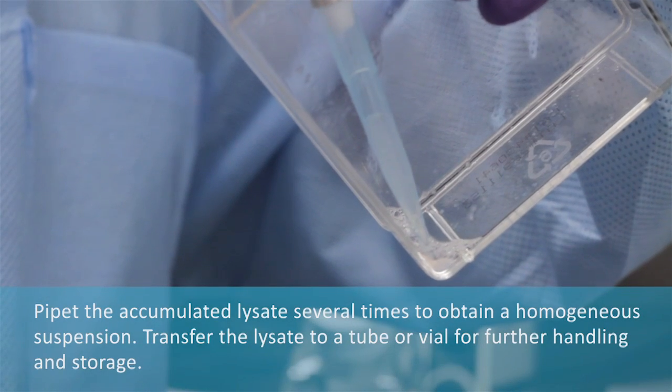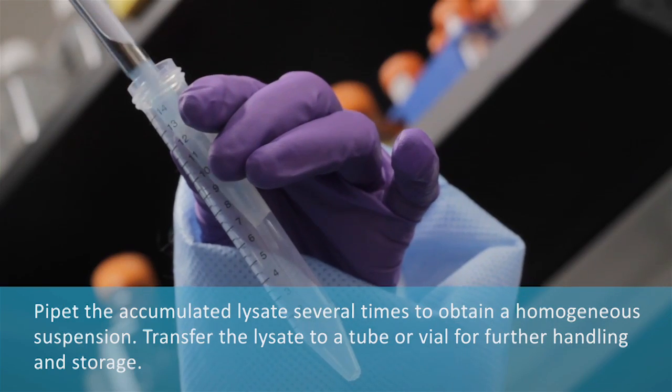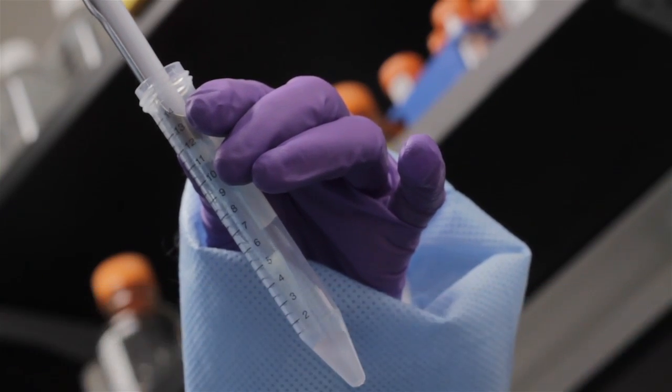Pipet the accumulated lysate several times to obtain a homogeneous suspension. Transfer the lysate to a tube or vial for further handling and storage.